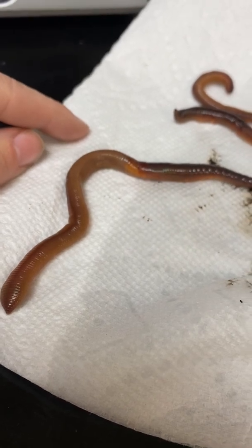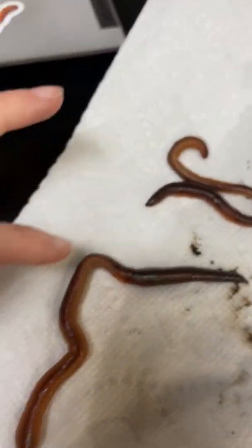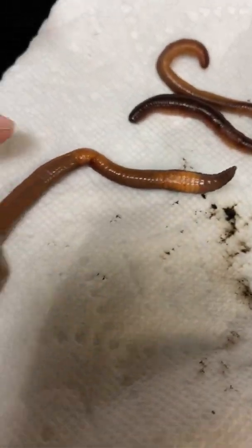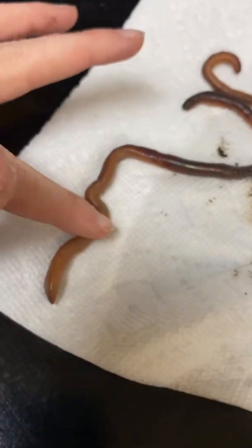Compare the coloration of the worm on the dorsal and ventral side. Which side is darker? As you can see, this is the dorsal side, the back side of the worm. And it is obviously darker than the ventral side, the underside of the worm. It's a lot lighter. And you're going to see that on the worm that you're going to dissect too.